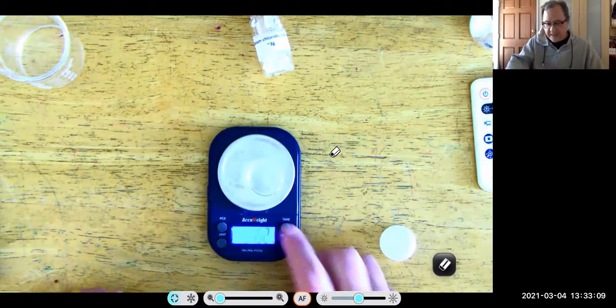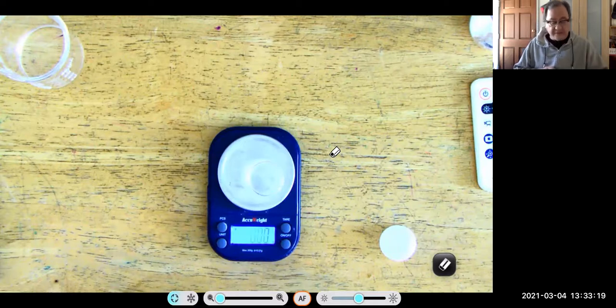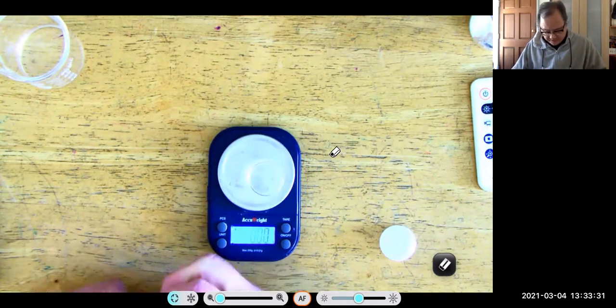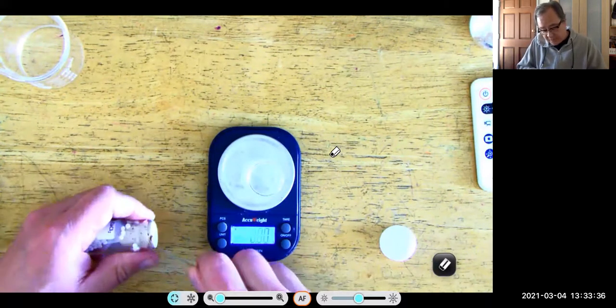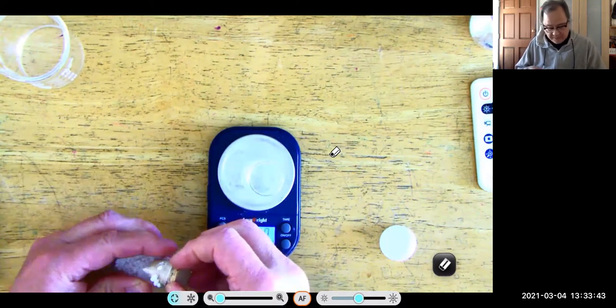Here. And I'm going to add enough calcium chloride so that if this is lithium carbonate, I will have more than enough calcium chloride to react with my lithium carbonate. Okay, so my stopper's in there pretty well, so I'm going to use my spatula to help unwedge the stopper. I'm going to do it very gingerly. And now the stopper's free.